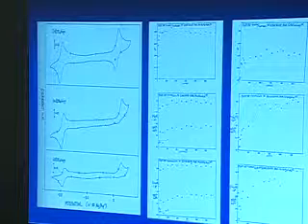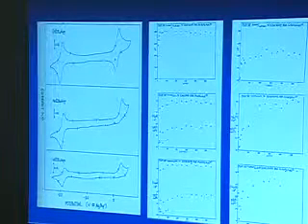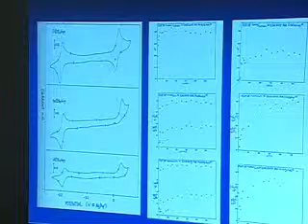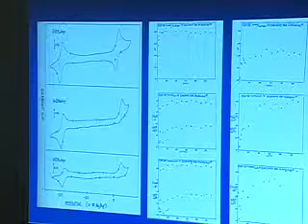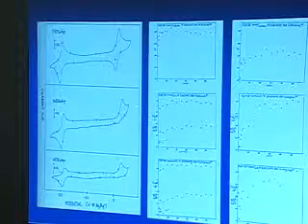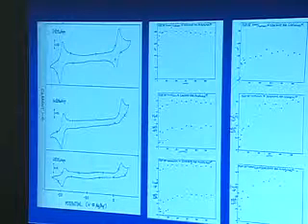Now, you can't just look at that, though, and say, oh, that is an irreversible process. Right? Irreversible would mean it's easy to pull the electron out, but you can't shove it back in. There's a big rate constant for moving it out, but not back in. Because it is equally likely that what's happening here is there's some chemical process, like the molecule falls apart after you pull an electron out, and there's no return wave because there's no molecule there to push an electron back into. So it could be an EC mechanism just as well.